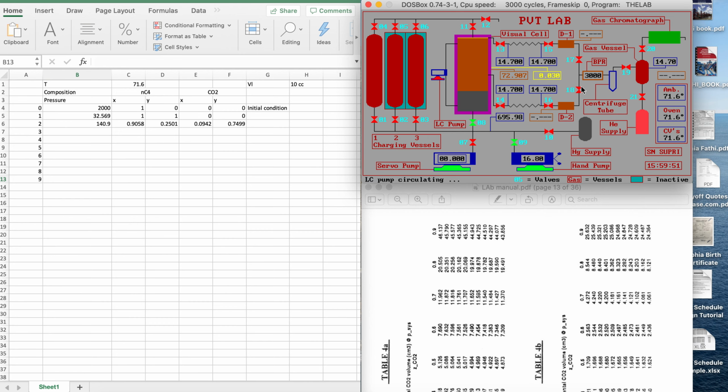I'm going to shake this out. As you can see, this is now more tricky since I have a mixture of 2 components. This time I'm gonna do 0.01. I want to make sure I get to that very slowly, and I'm gonna shake this out.